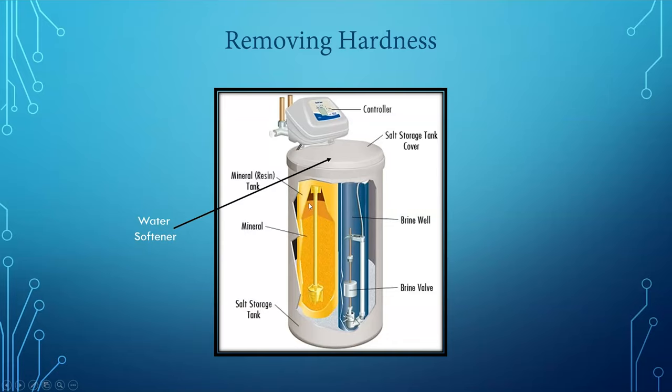When you pass your hard water through there, the sodium ions are released and the beads collect all of the calcium ions, and sodium ions don't cause any problem. Sodium ions don't precipitate. There's also some salt in here, and the salt is used to return sodium to the beads once they get full of calcium.